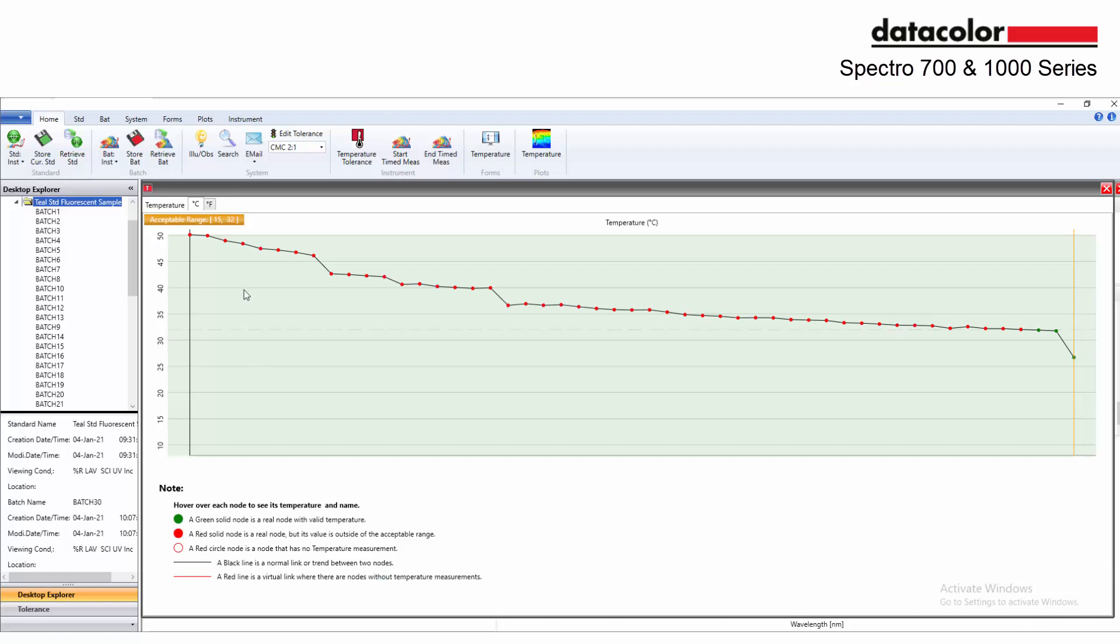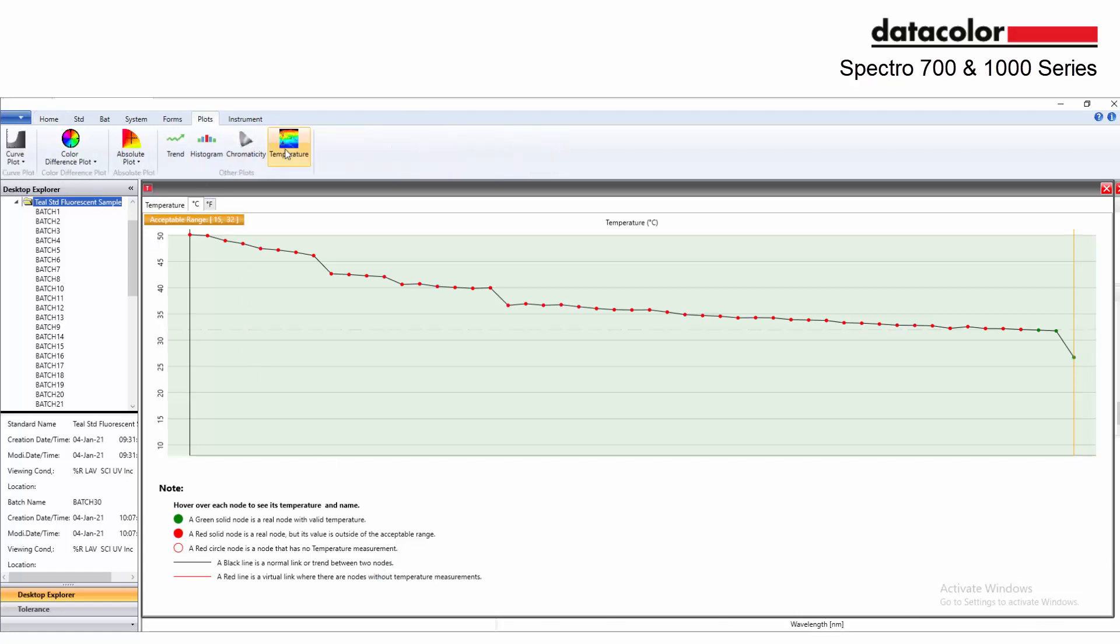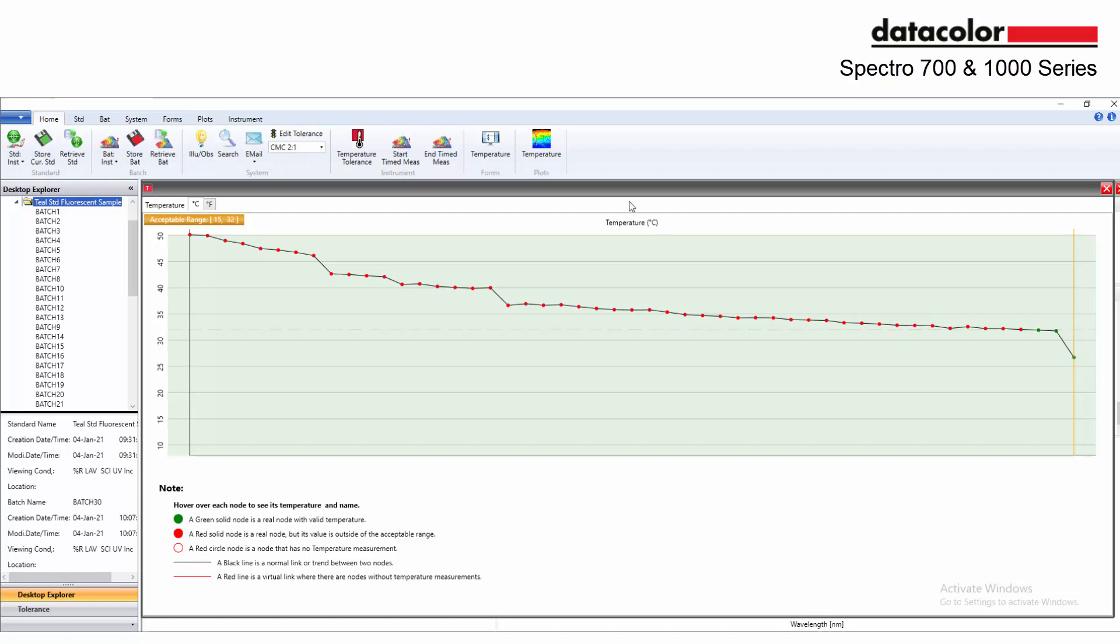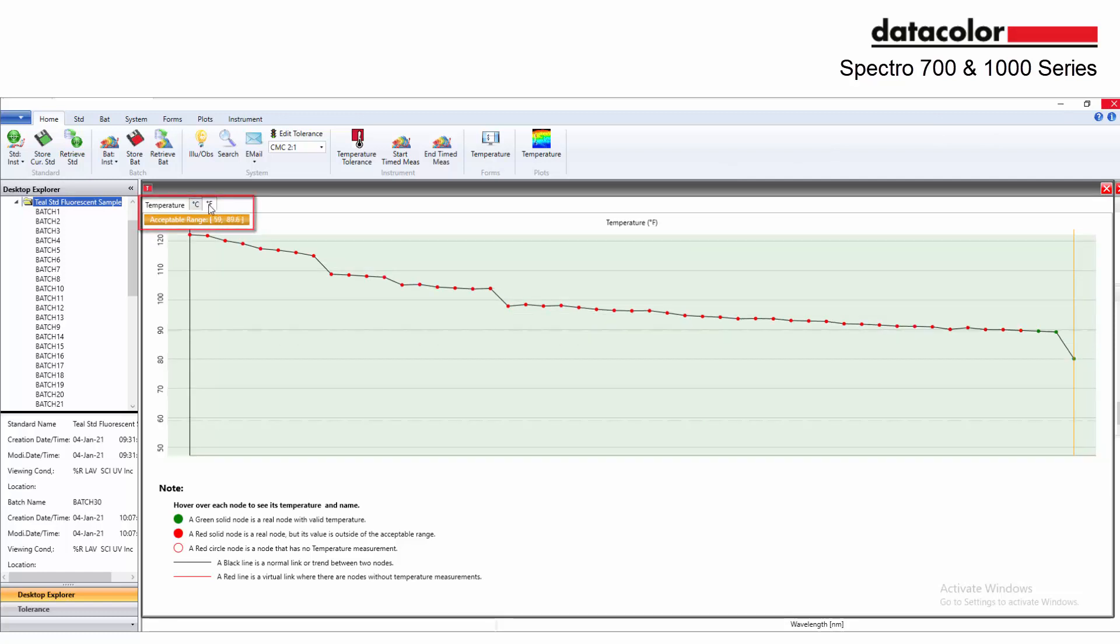This plot is available under the plots menu. A direct access icon can be added to the home bar or directly on the template as in the example. The temperature plot can be displayed both in Celsius or Fahrenheit.